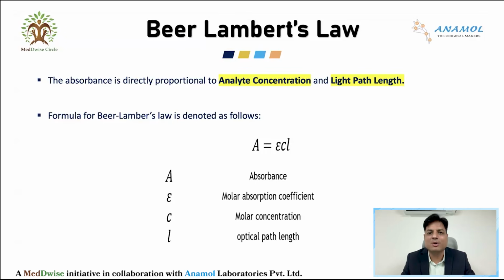Similar thing also happens for estimation of glucose. Hypothetically, I only have one test tube and in this one test tube, I add patient sample and it will form a color. How will I come to know that this color means XYZ concentration of glucose? I will not come to know until and unless I also run one more test tube along with this, which has a known value. Let's say this test tube is for a standard.